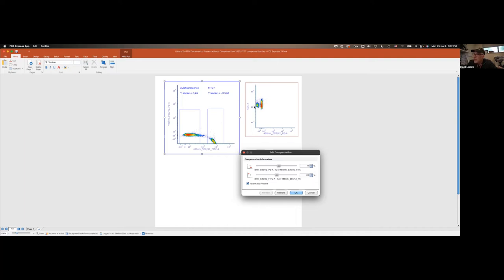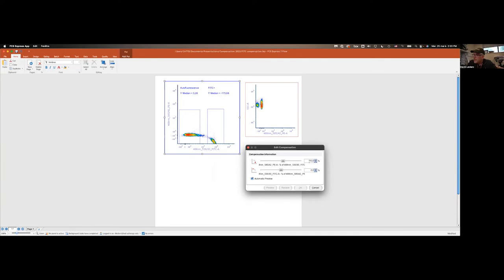If I increase the value to something higher, now the population curves down, and we're overcompensating our data. My median value is at minus 173. The presence of the artifact is an easy way to identify issues with your spectral overlap correction. If you understand what we have done here for the correction of FITC in the PE channel, you basically understand compensation in general.